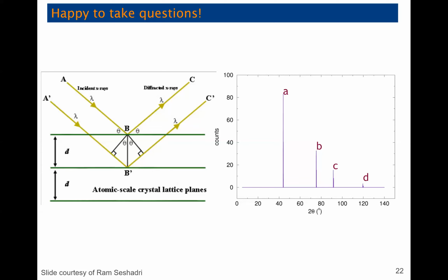We have some X-ray diffraction sample holders where, and Elias has tried to work on improving this, we both work on a lot of air sensitive materials. So we're trying to find a way. Normally during an X-ray diffraction experiment, your sample is exposed to air. And even if it's a quick experiment, sometimes your samples take on water really quickly or oxygen. They oxidize. So Elias is working on making a better air-free holder.